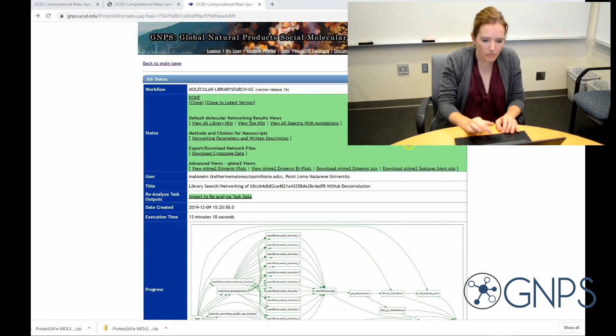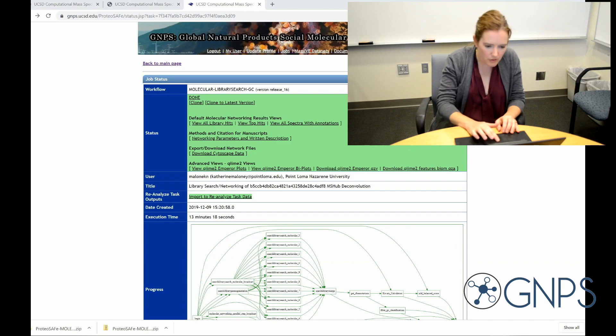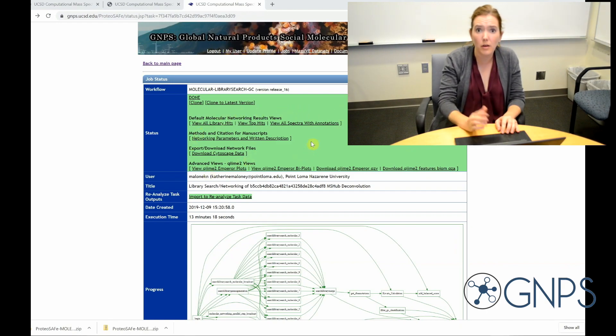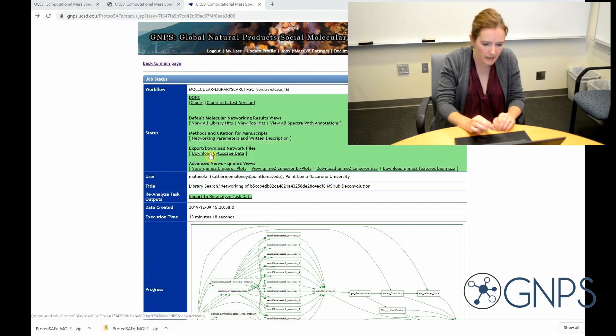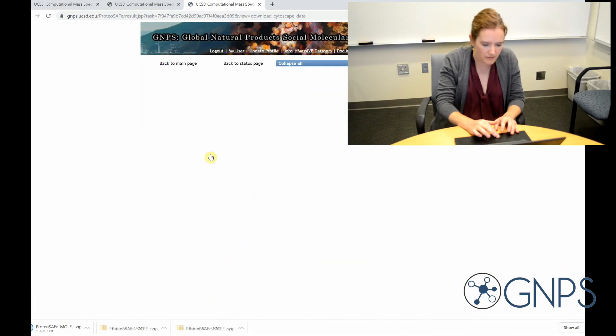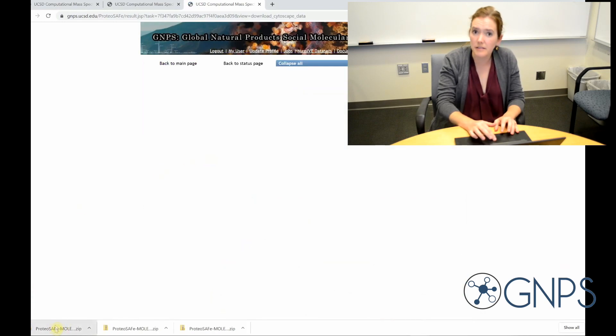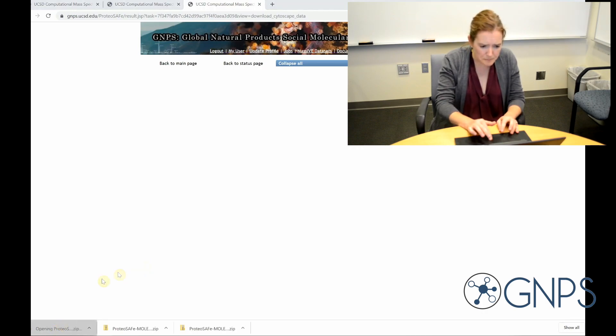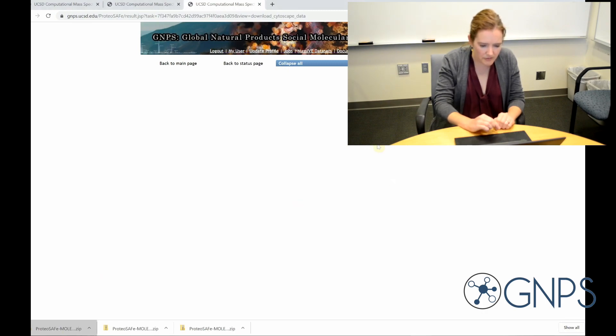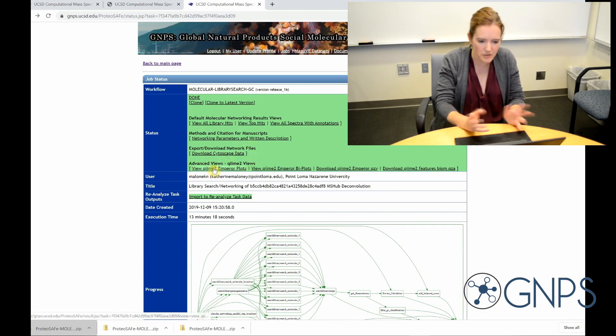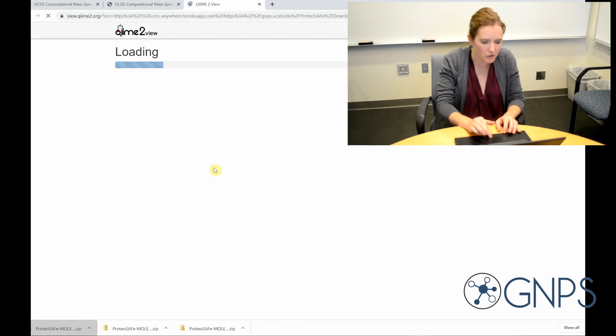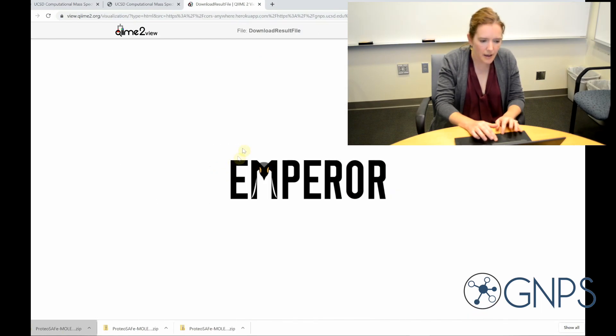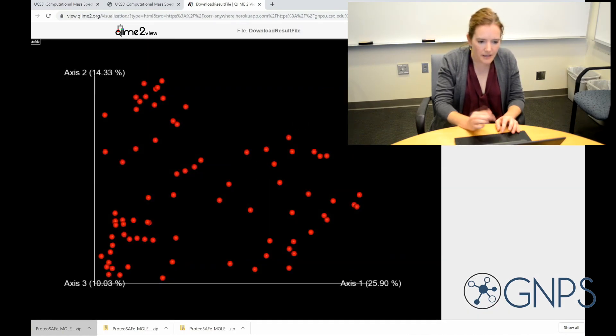Okay, so there's a variety of other things I can see here as well. If I want to look at my molecular network in Cytoscape, I can click here, and then this GraphML file is the file that I would open in Cytoscape to look at my network. I can also look at a PCoA plot of my data using Emperor, which is pretty cool.